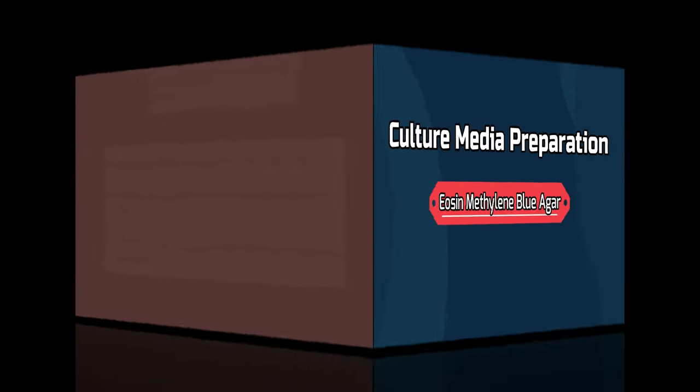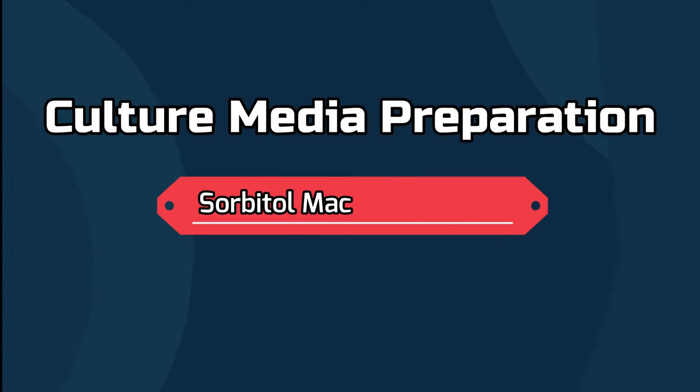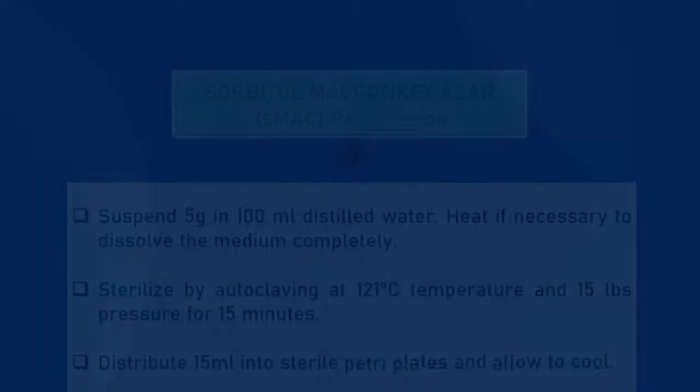To prepare EMB agar, dissolve 3.6 grams dehydrated media into 100 ml distilled water. Autoclave at 121 degrees Celsius and 15 pounds pressure for 15 minutes. Distribute 15 ml into sterile plates. To prepare SMAC, dissolve 5 grams dehydrated media into 100 ml distilled water. Autoclave at 121 degrees Celsius and 15 pounds pressure for 15 minutes. Distribute 15 ml into sterile plates.